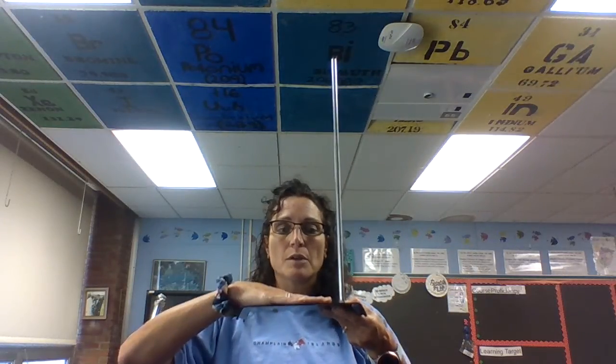Hi, I'm Mrs. Kendrick and I'm holding a ringstand. A ringstand is composed of one long metal rod and a really firm base.